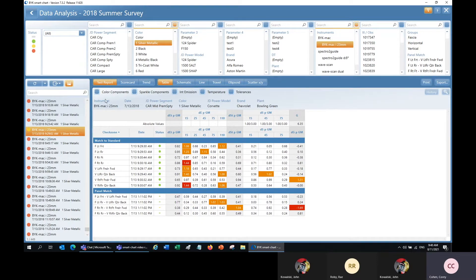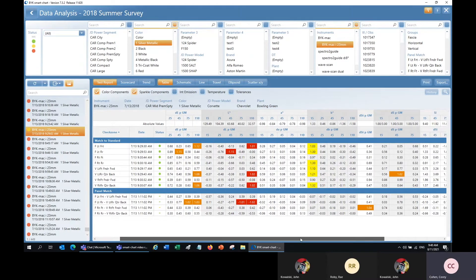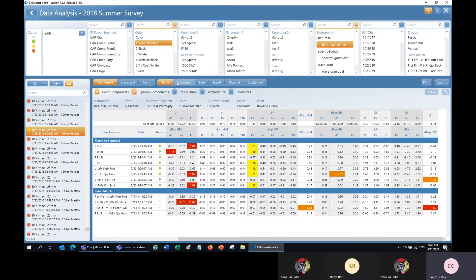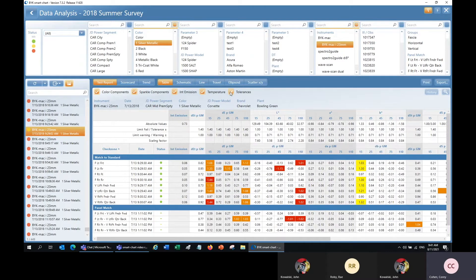If I click color components up at the top, I can also see the delta LAB values. I can check sparkle components to add those — here they are to the right. I can also add the intensity emission, the temperature during measurement, and the tolerances that were set for the standard.